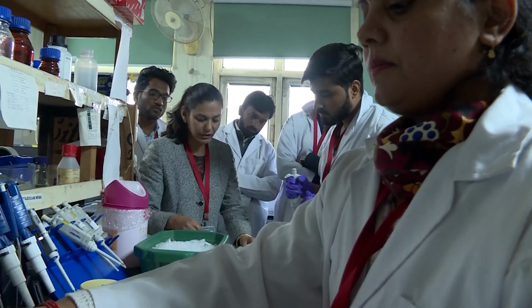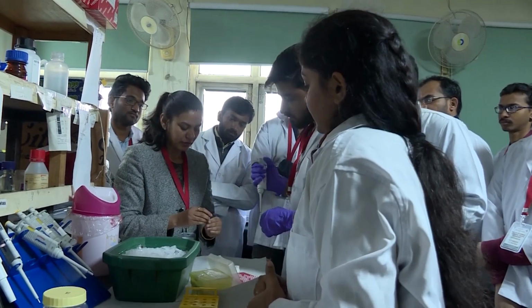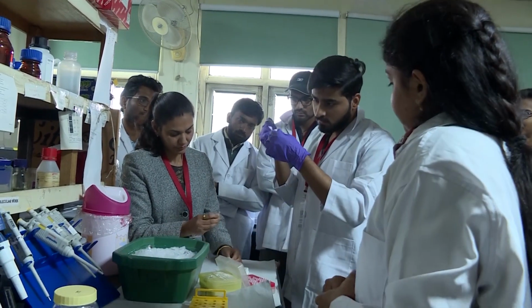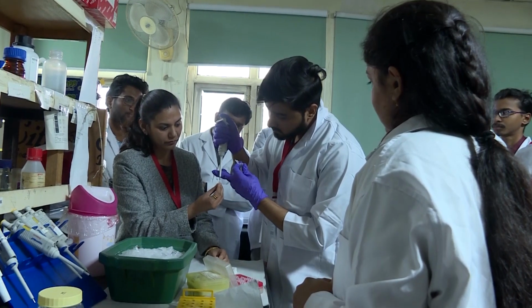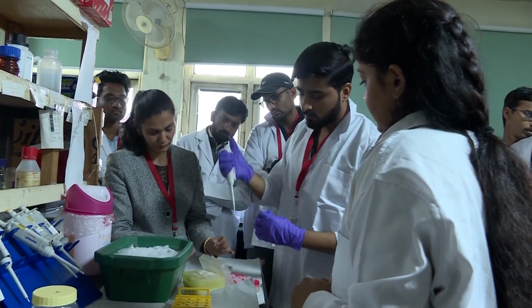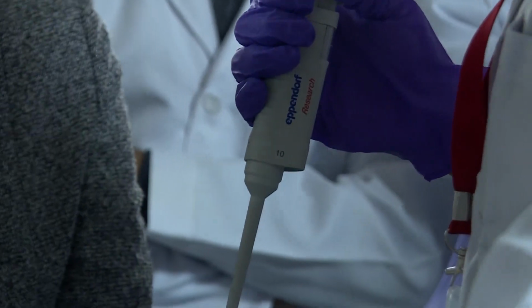Okay, now MAP kinase forward primer. This is the forward primer. Okay, so up to primer, now it is okay.